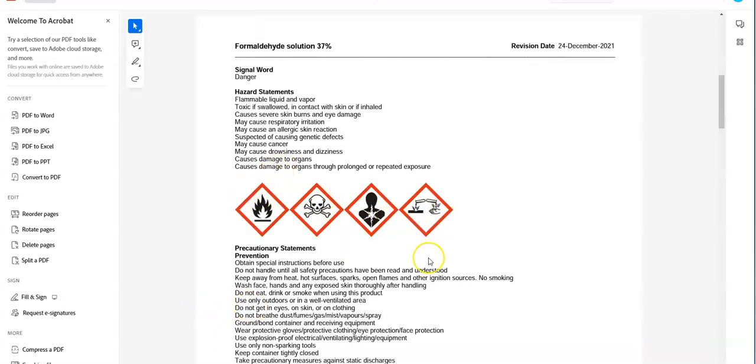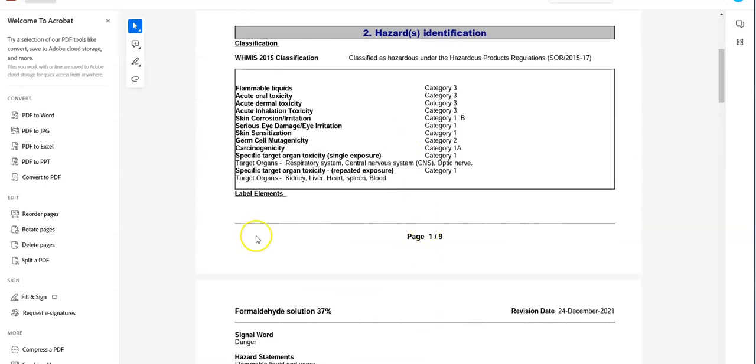So here's all the hazards that apply, and then when we look up to see those that are in category 1, we're seeing skin and eye corrosion, and then skin sensitization, mutagens, carcinogens. Those are category 1s as well, I guess, except for mutagen. But those all would fall into that acutely toxic or chronic category for creating your hazard class SOP.